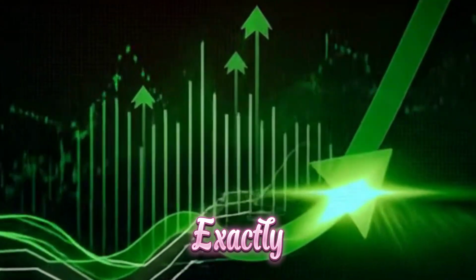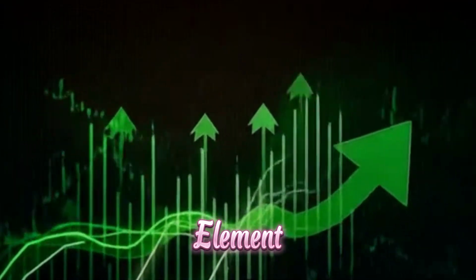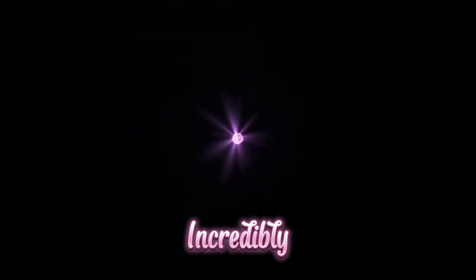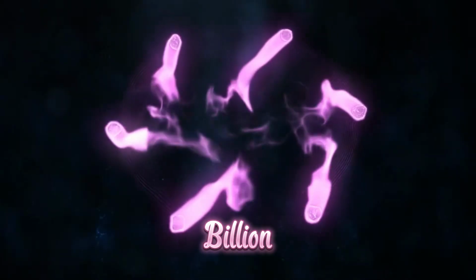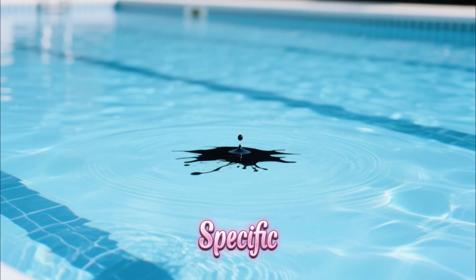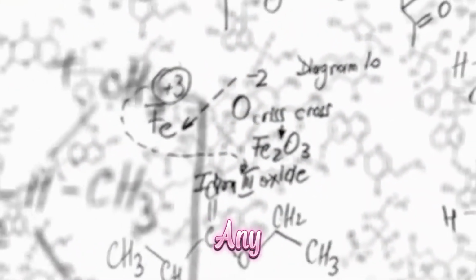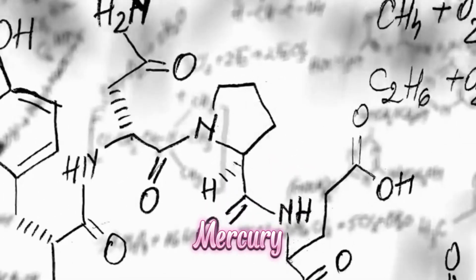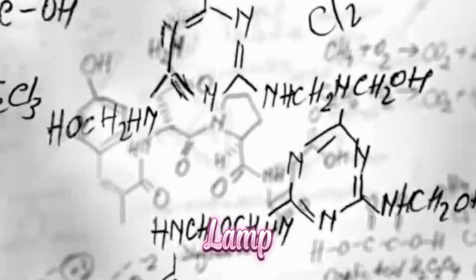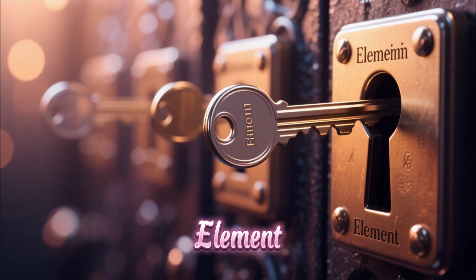By measuring exactly how much light is absorbed, we can calculate the precise concentration of that element in our original sample. It's incredibly sensitive, able to detect elements down to parts per million or even parts per billion. That's like finding one specific drop of ink in an entire swimming pool. And we can do this for almost any metallic element, from calcium and magnesium to heavy metals like lead and mercury. We just need to swap out the lamp for the specific element we want to find. It's like having a whole set of keys, where each key only unlocks the secret of one element.